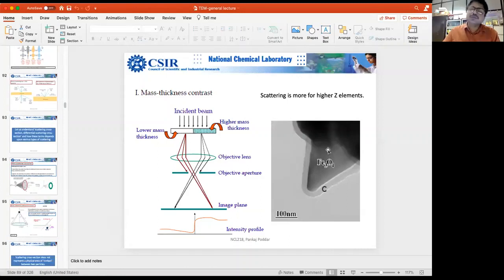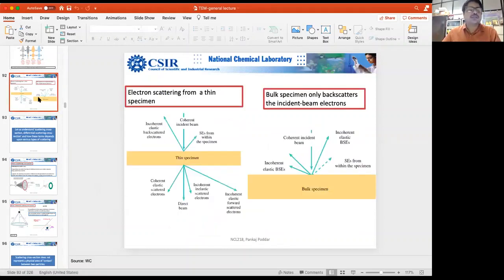That is a typical interview question, which we ask when we grill students for faculty positions when they come after postdocs. Why in your TEM images is some particle looking darker? Suppose you take 10 different iron oxide particles, some of them still may look darker than others. That is because of this crystallinity contrast. I think you got it, right?